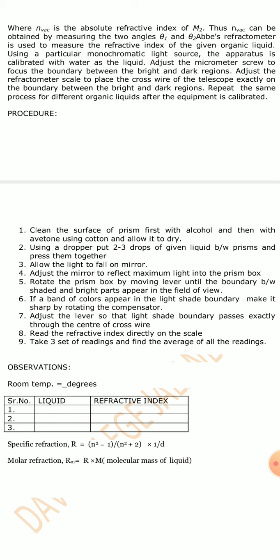This is the result table for the specific refraction and molar refraction of the compounds A, B, C, D. Therefore, four compounds with their refractive indices. This is the experiment: apparatus, chemicals, procedure, theory, observation table, and lastly the result table.